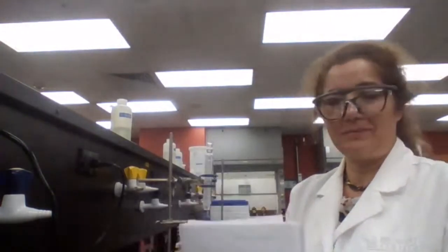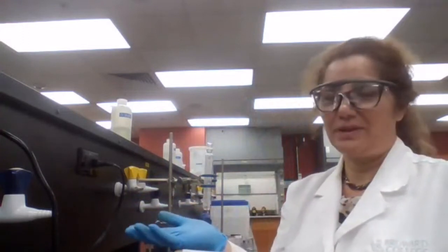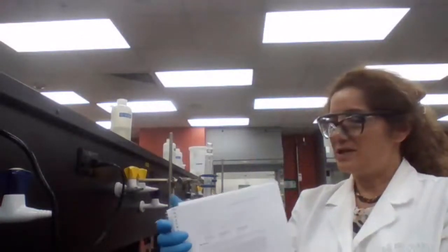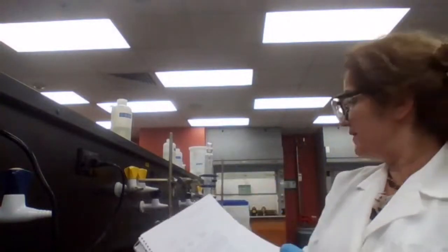if your sample is not pure, if it has any alcohol impurities, it's going to show a peak at 3300. Then you don't know if this is coming from the carboxylic acid OH or the alcohol impurity, or if there is leftover benzoic acid. Because you are washing with water and with sodium bicarbonate, benzoic acid should be removed during the experiment. But if there is any leftover, it's also going to have a broad peak between 2500 and 3500. So the method used for identification today is going to be IR.